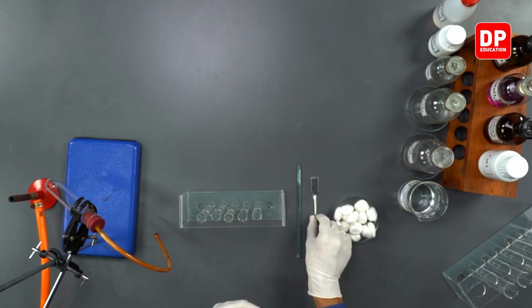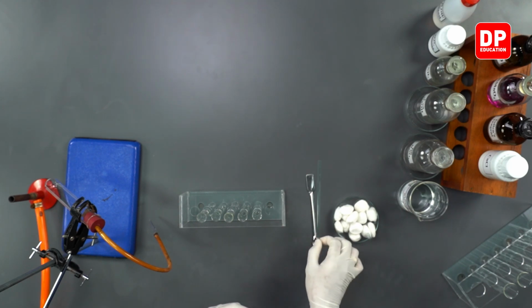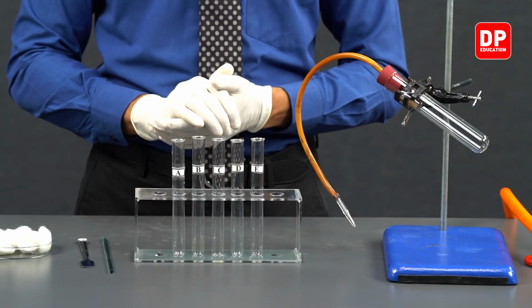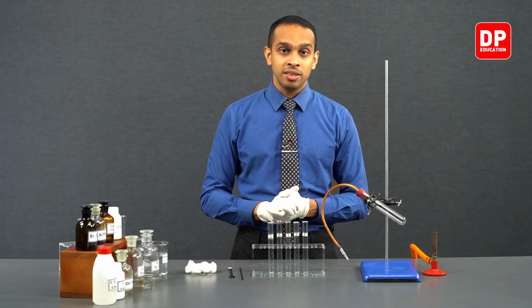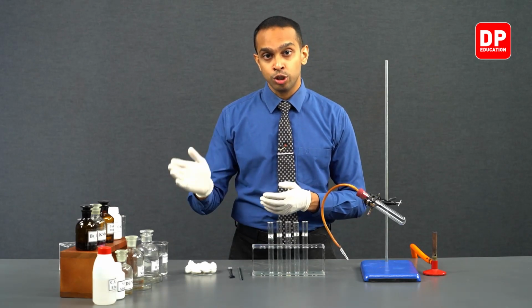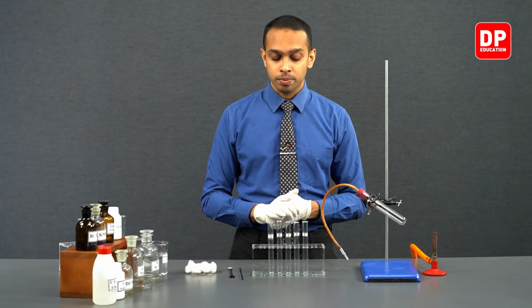Apart from that, we will be using cotton wool. We have a spatula, and we will be using a glass rod. We have some test tubes here. Please notice that we have labeled these test tubes. We will be taking different reagents into each of these test tubes. To identify which reagent is present in which test tube, we have labeled them.